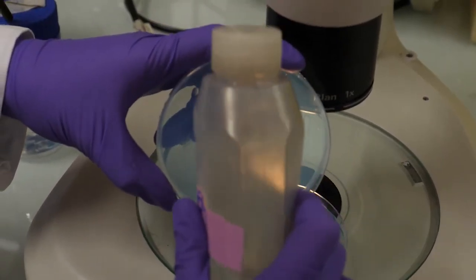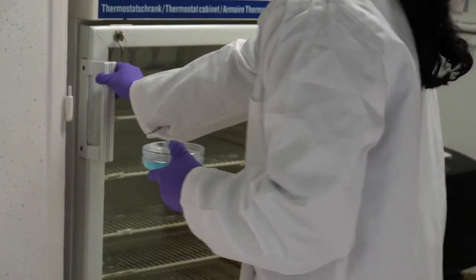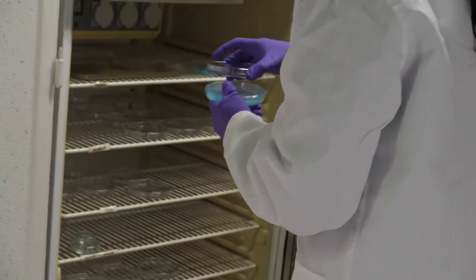After microinjection, the embryos are transferred to a new petri dish containing embryo medium and incubated at 28.5 degrees Celsius.